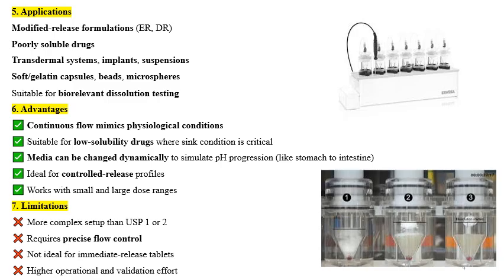Then what are the specific applications? Why was this type of apparatus designed? It is mainly used for modified release formulations like ER and DR, poorly soluble drugs, transdermal systems, implants, suspensions, soft gelatin capsules, beads, and microspheres, and it is also suitable for biorelevant dissolution testing. The main application is for formulations containing poorly soluble drugs.